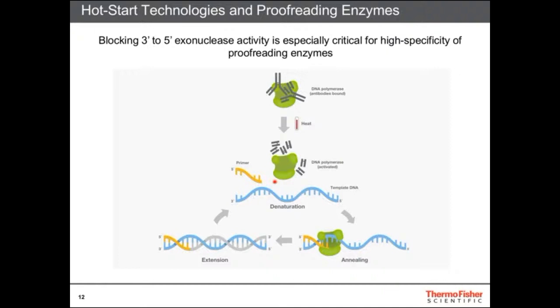Because what we did discover is if this exonuclease activity is left unprotected prior to PCR, and you leave your reaction on a bench, that exonuclease activity could potentially hydrolyze the primers that you're going to be using in your PCR reaction, which would create either no amplification or nonspecific amplification due to the degradation of your primers.